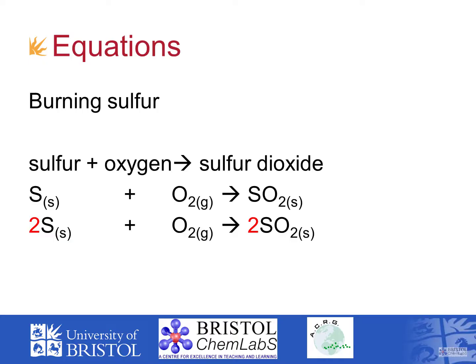If you're going to use the same gas jars all the time, I suppose a drop of superglue wouldn't hurt. However, work out where the spoon of the deflagrating spoon should be in the middle of the gas jar in advance. Load your material into the spoon.